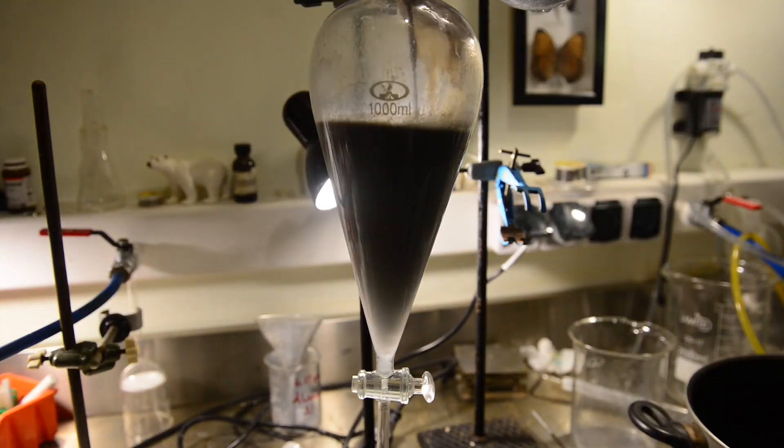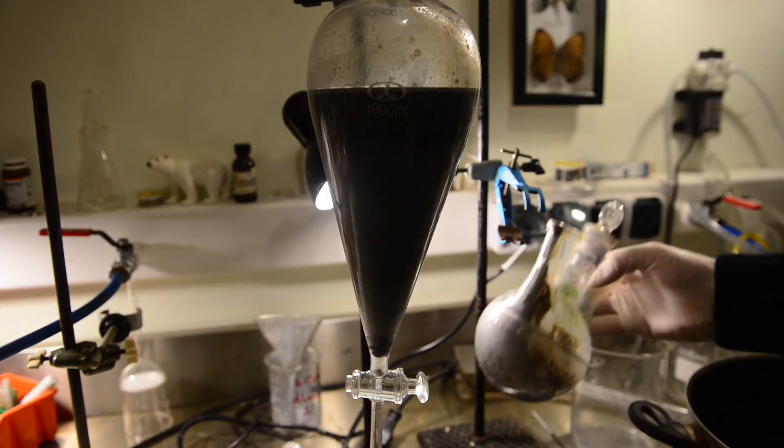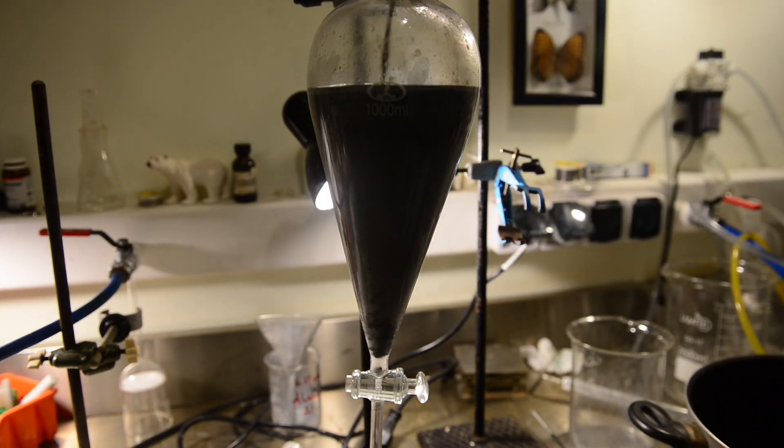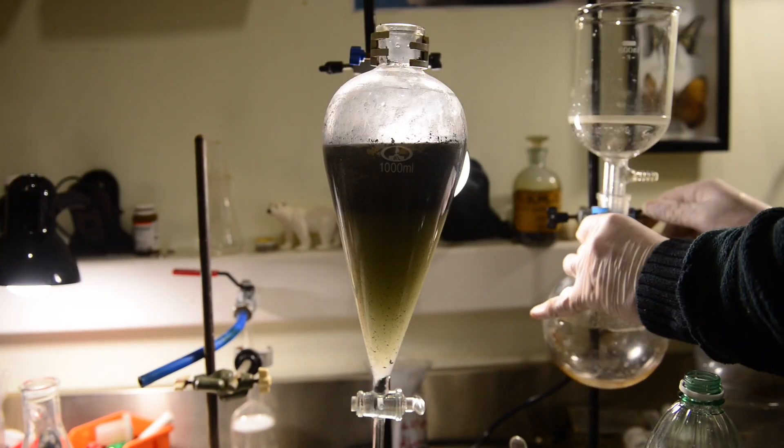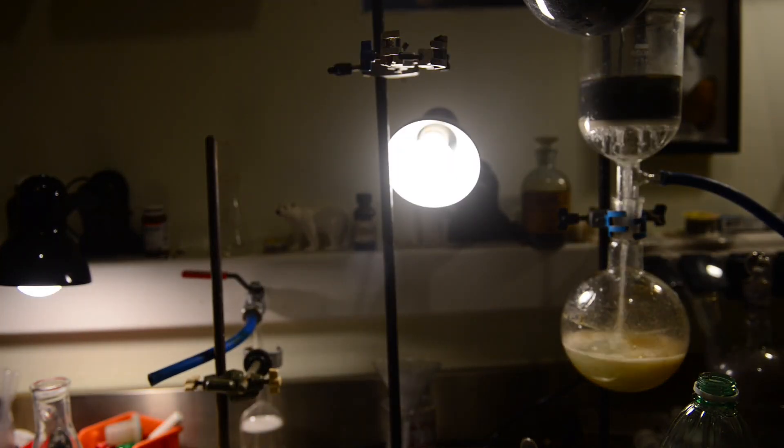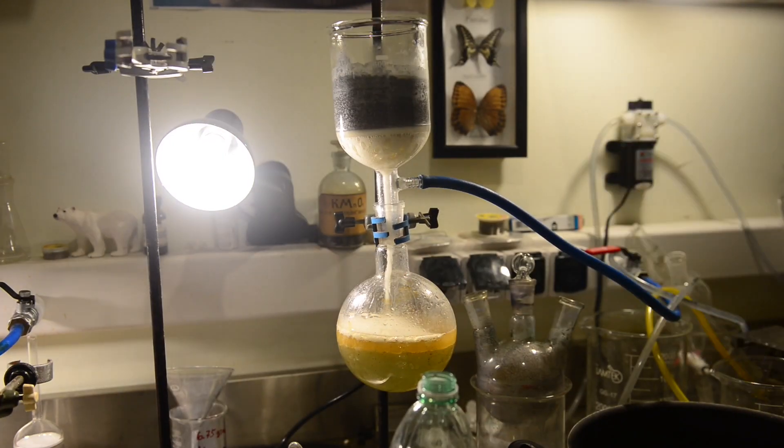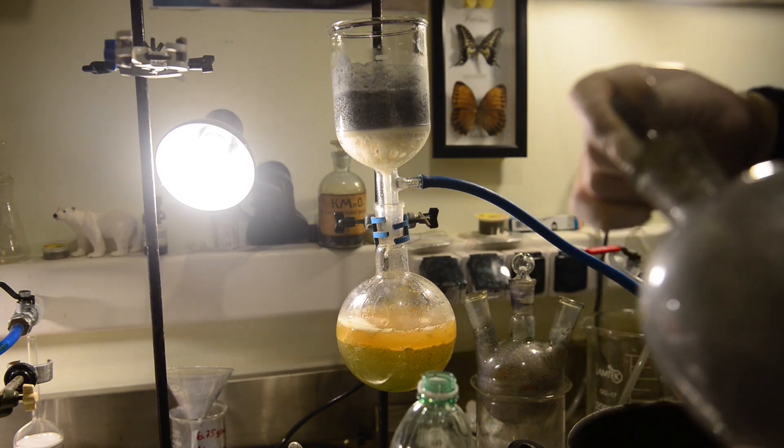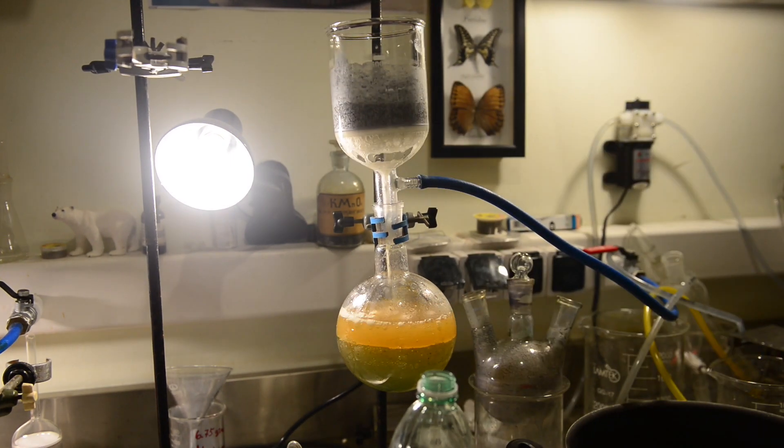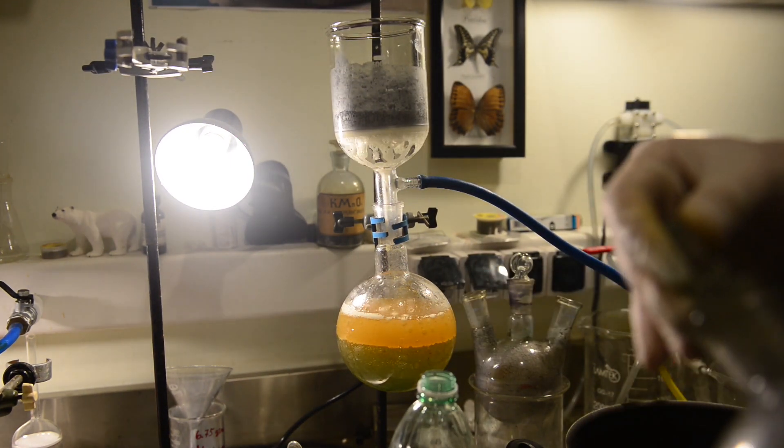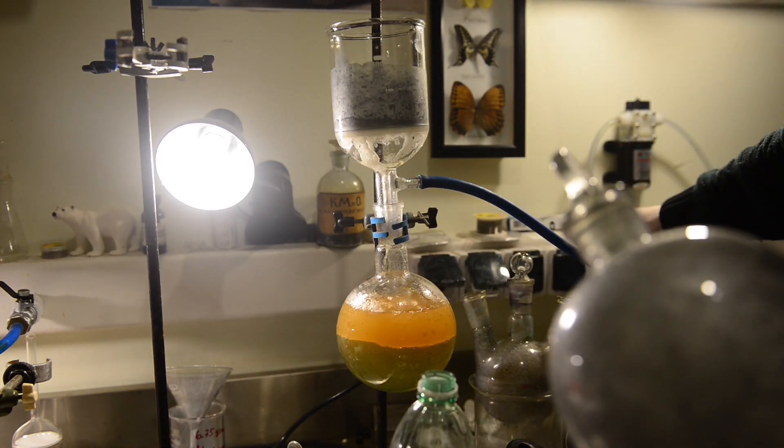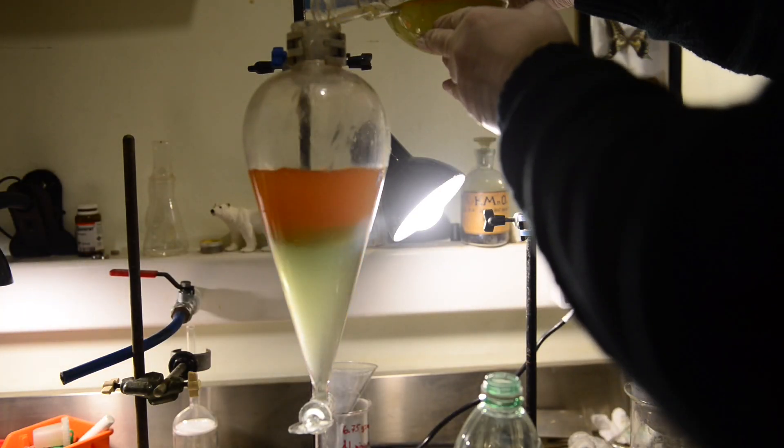Now I decant the whole beaker into the large separation funnel. But there are a lot of unreacted aluminum particles in the organic phase and I decided to filter it. I'm using vacuum filtration for this. The filtered solution is free of aluminum and phases separate in the filtration flask. I move filtrate to the separation funnel again.